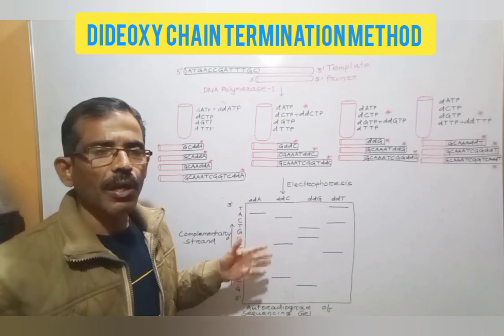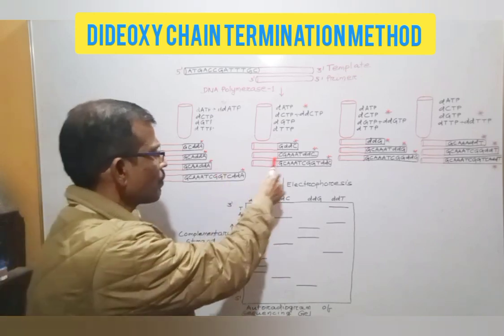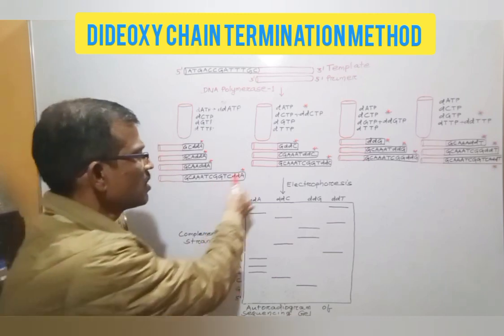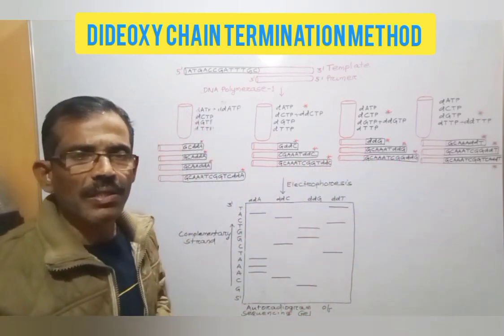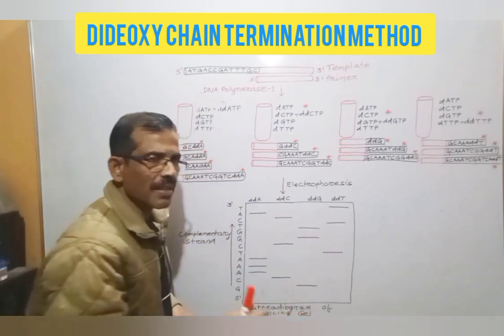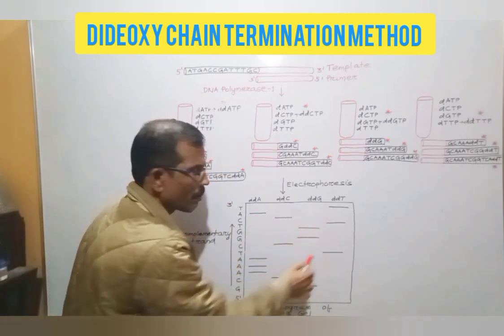After generation of the labeled DNA fragments, they are separated by electrophoresis by loading into a polyacrylamide gel. The DNA fragments, because of differences in their molecular size, will migrate at different rates under the influence of the electric field. As a result, they will be separated into different bands.